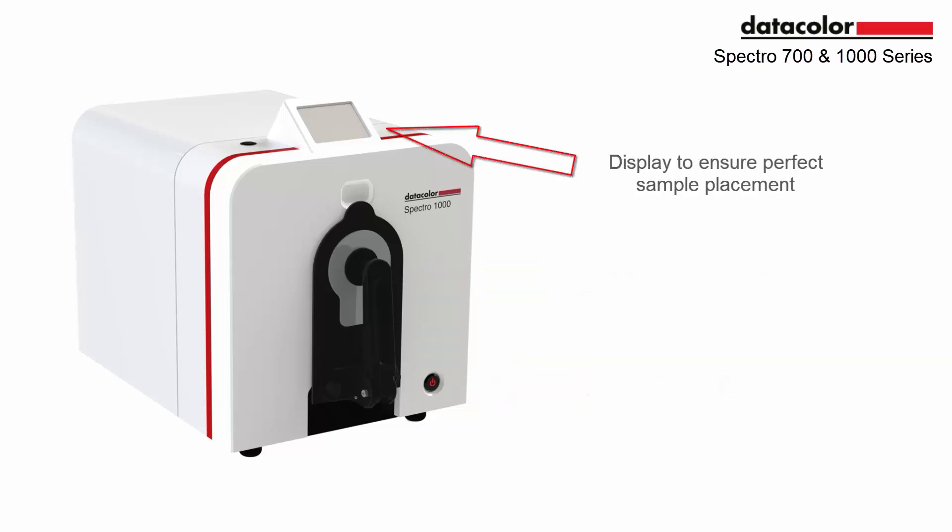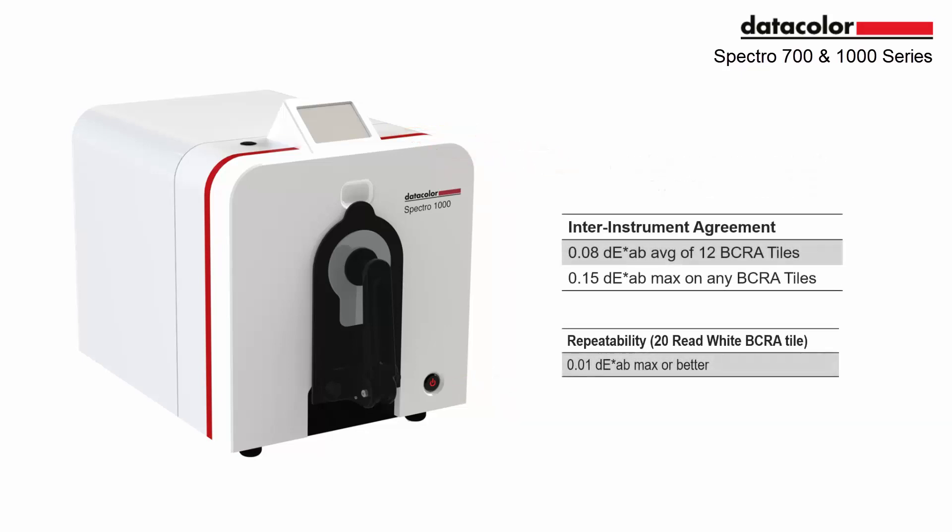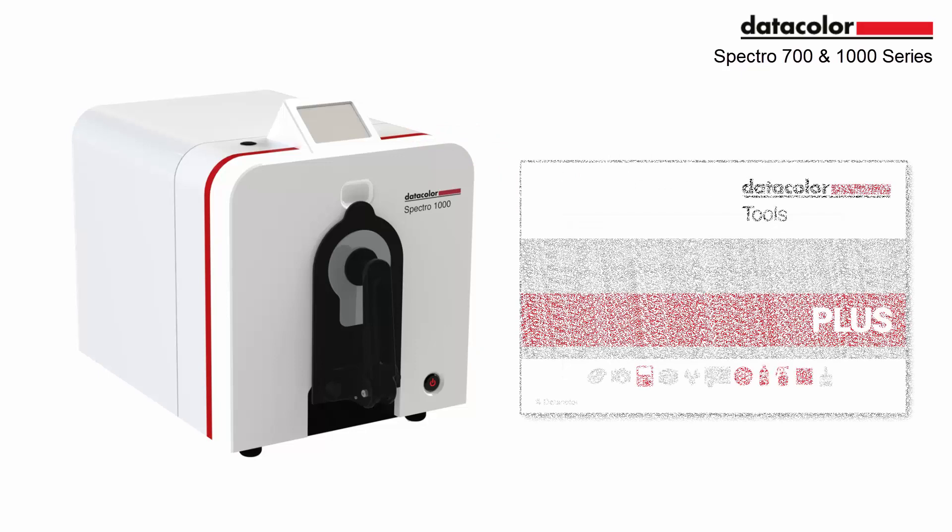The display is fixed to ensure perfect sample placement. The instrument maintains the same inner instrument agreement and repeatability as our previous 500 and 800 series.